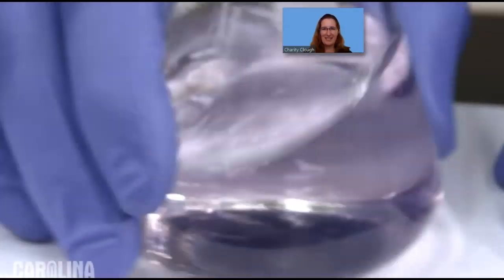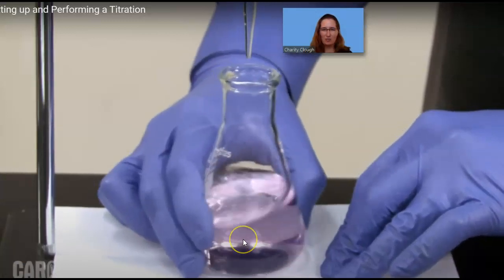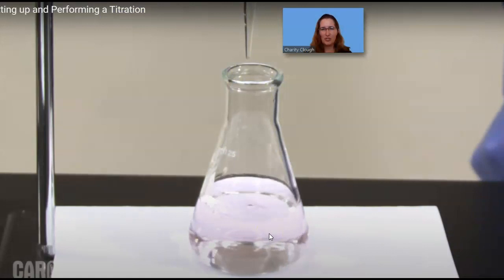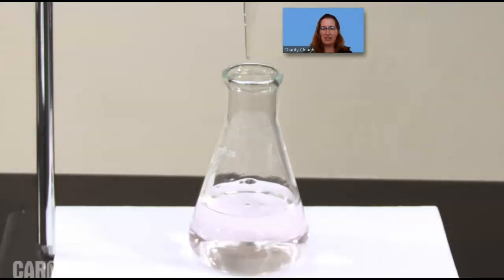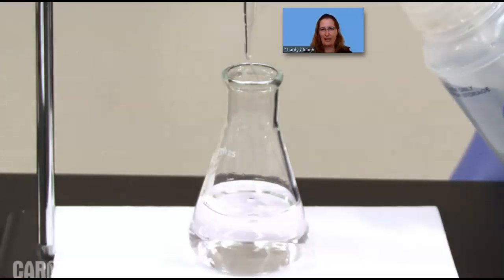If you guys get the chance to experience this, you'll find the joy of getting that exactly right equivalence point where you get a faint pink that sticks in your solution. And you'll probably experience the agony of getting impatient and going too fast and having it turn really dark pink.